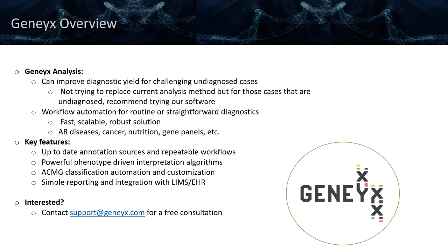In terms of the workflow automation, this is a scalable solution for those more straightforward diagnoses. So it's a fast, scalable, robust solution. Prime examples could be autosomal recessive diseases, cancer, nutrition, gene panels. So there's a variety of different applications that can be performed with the Geneyx Analysis software.